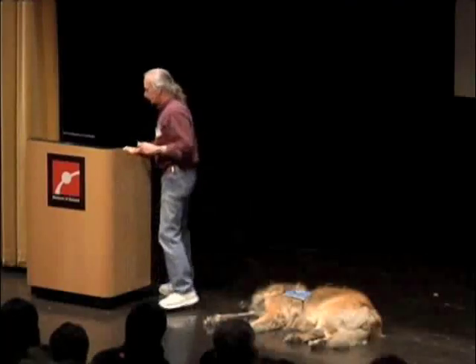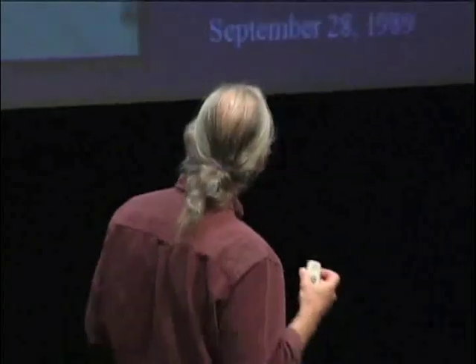So one of the things that we learned to do in our laboratory was to take this tool, which was invented for imaging, to be kind of our eyes to the world of atoms, and use it as a set of hands, allowing us to manipulate individual atoms. Let me show you how we do that. We take advantage of the fact that atoms are sticky.